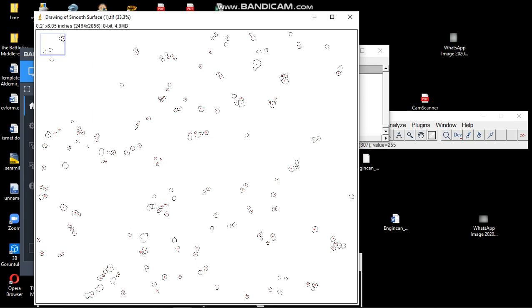Osteoblast cells turn tissue into bone. We can say bone cells, and these cells attach generally to implants from the body, and this is important.